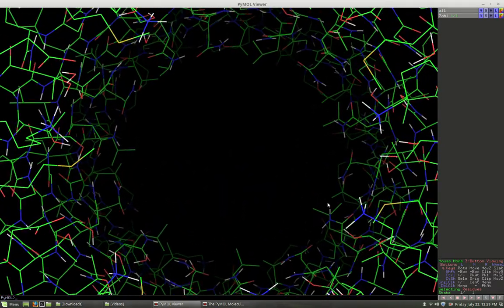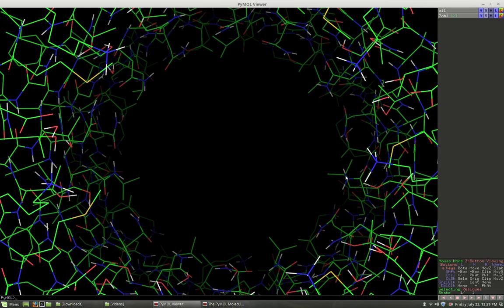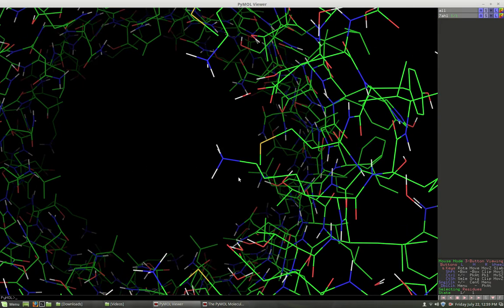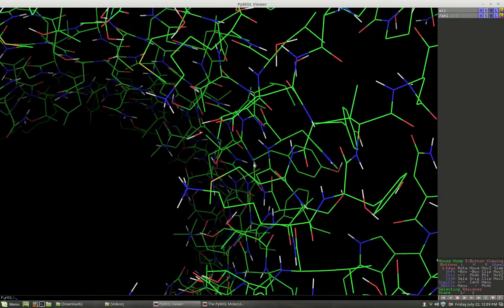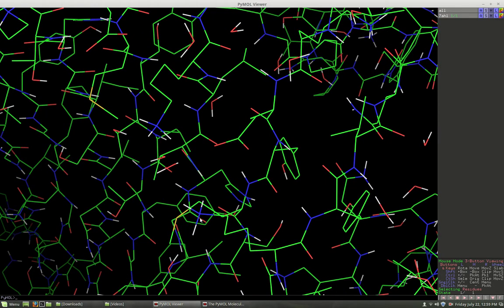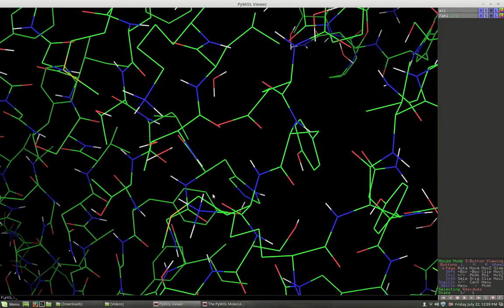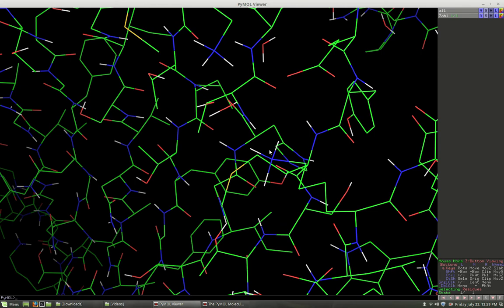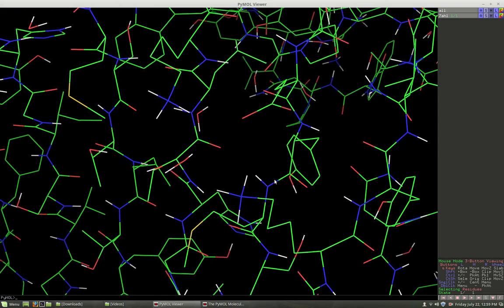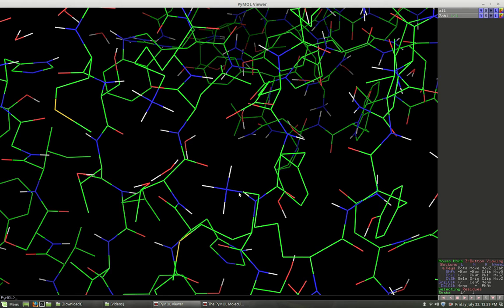Now I've zoomed in here, and then I'm going to use the first mouse button. I'm going to kind of rotate it. I'm going to move it to the middle using the middle mouse button. Alright, and then maybe zoom a little more. See if I can maneuver so that I can see one of those residues up close. And I'm looking for this right here. There we go. Moving this. Now this does take some practice. You have to get used to all three mouse buttons.